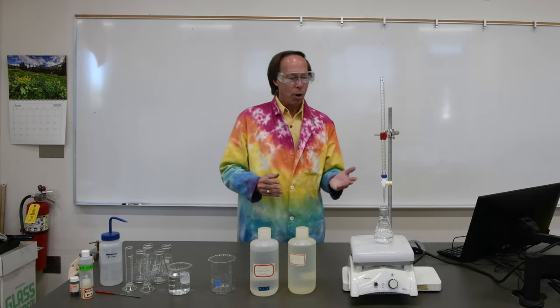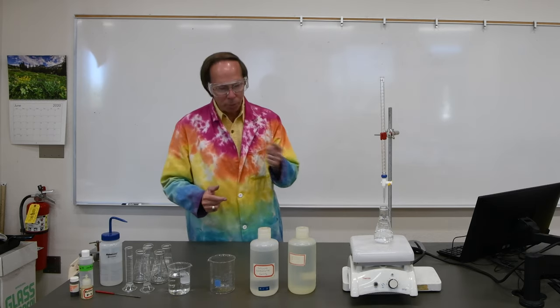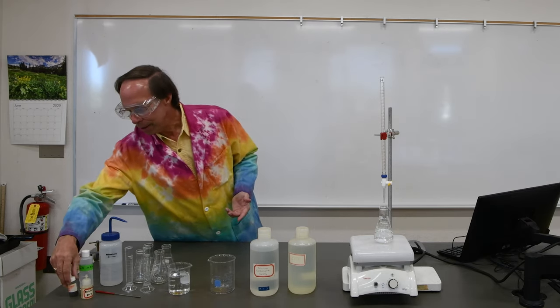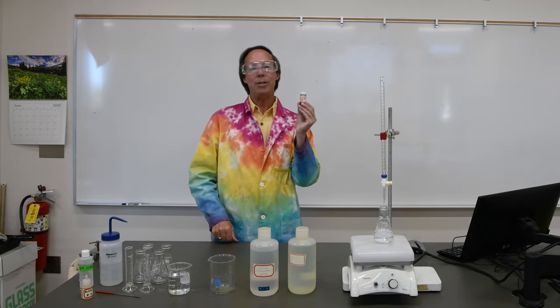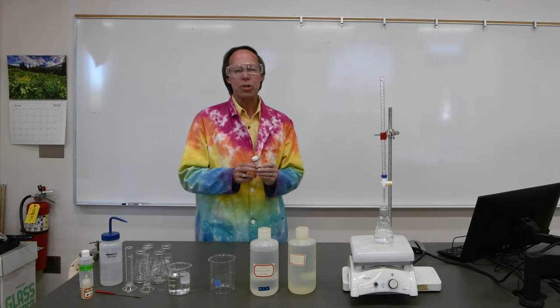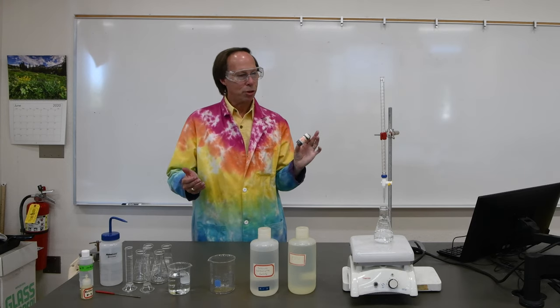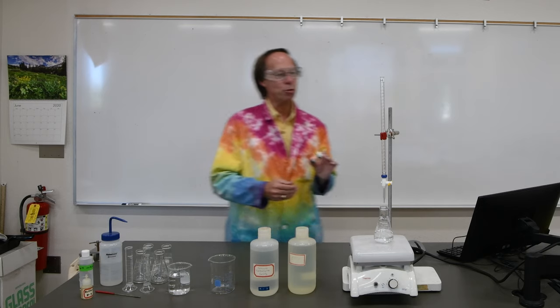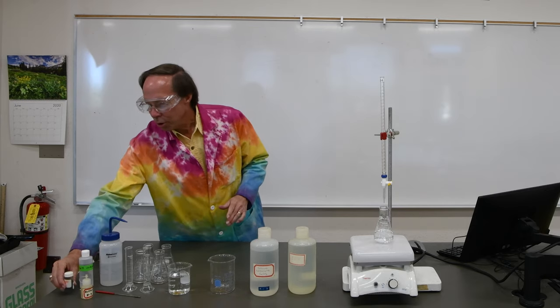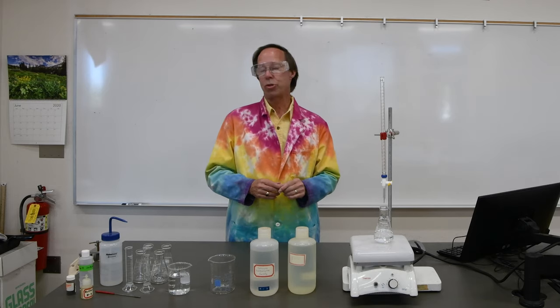Now, you may remember when we did our cabbage juice lab, we used cabbage juice as an acid-base indicator. It turned different colors depending upon the pH. For calcium, we have a special indicator called Eriochrome Black T. It just happens to be a chemical compound that's very sensitive to calcium. As you'll see when we go into the lab, in the presence of calcium, it turns bright red. If the calcium is absent, it turns a lovely blue, sort of like the red on the clamp and the blue on our burette. So we're going to be adding some of that indicator to our sample, and when the calcium is there initially, of course, it will look red.